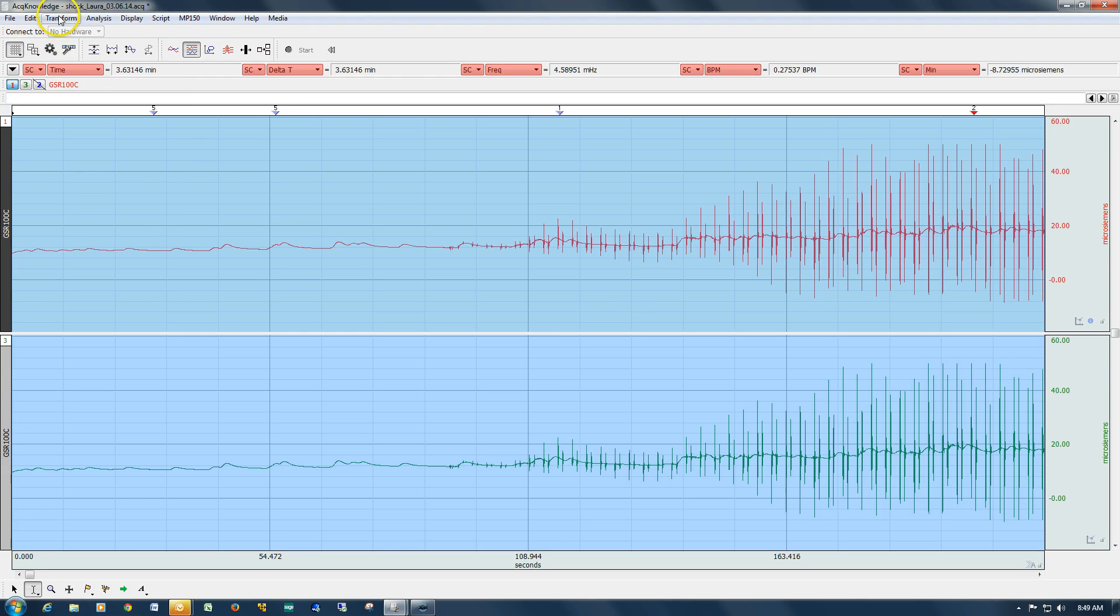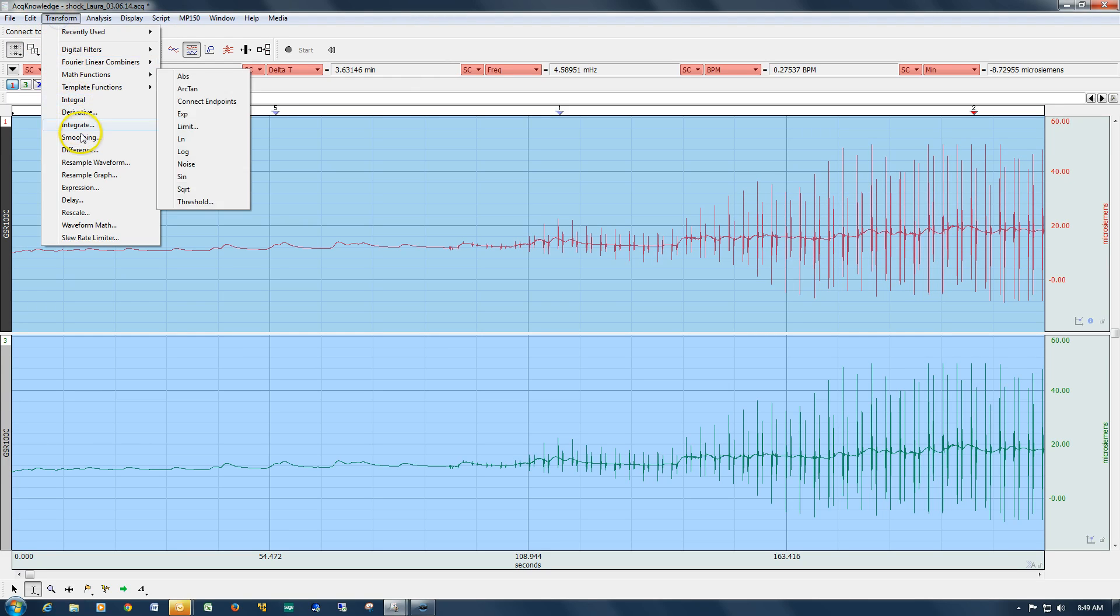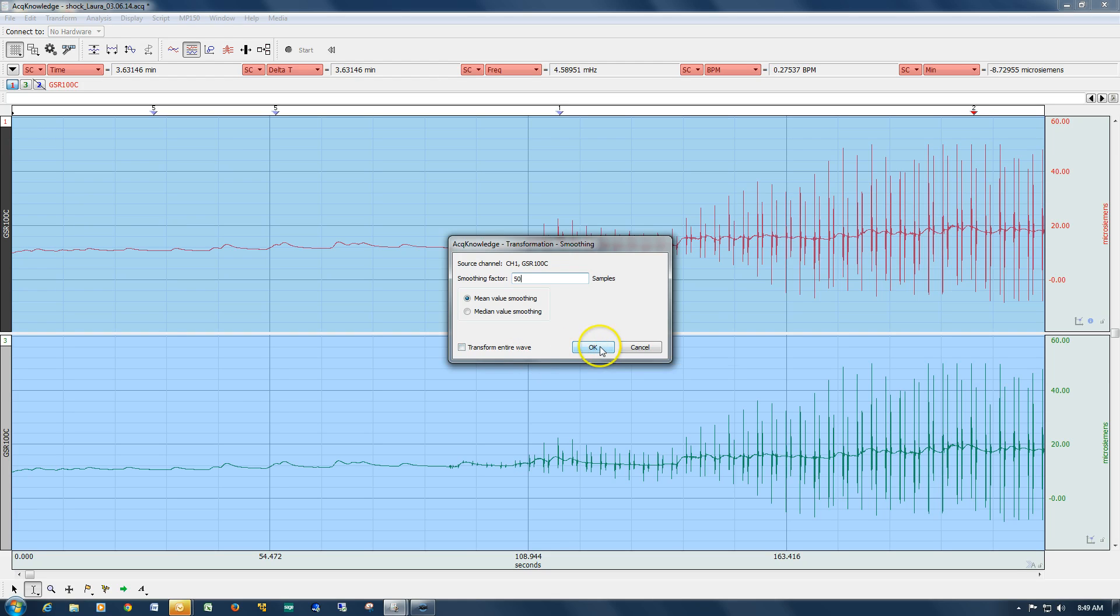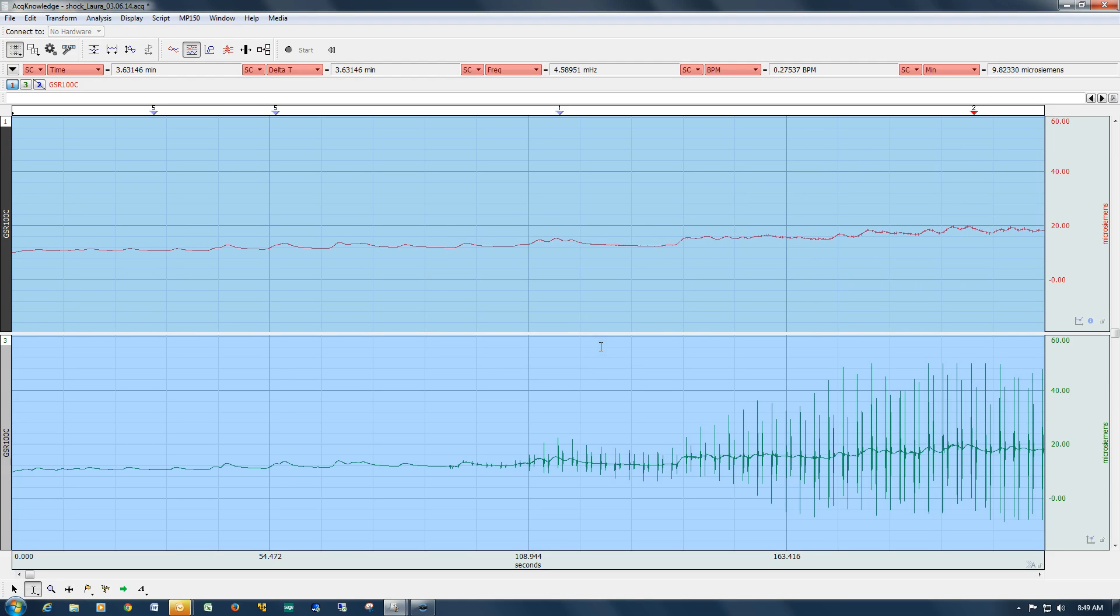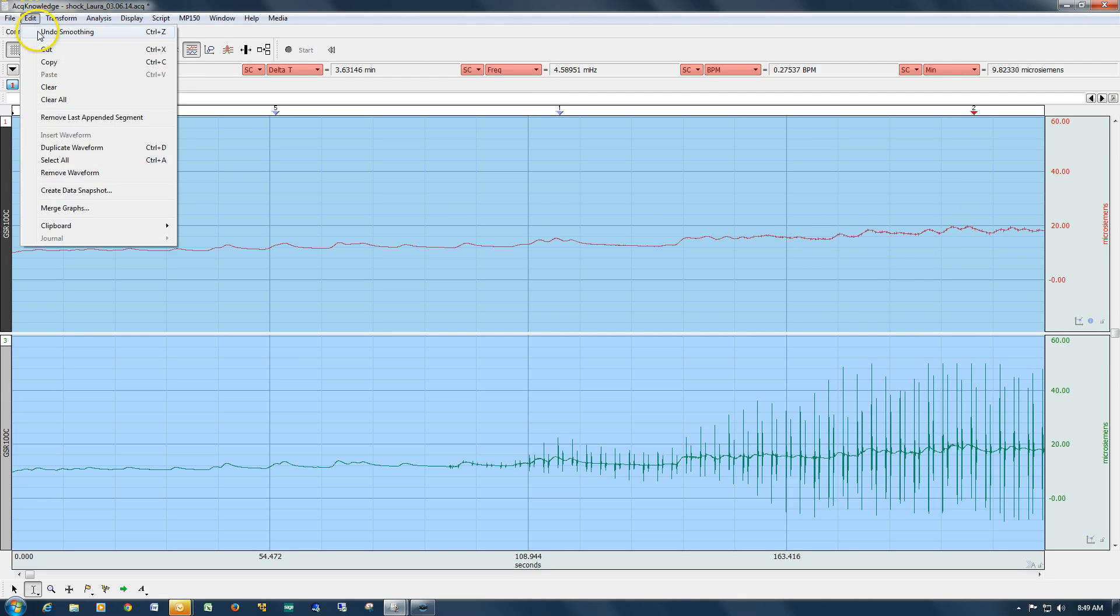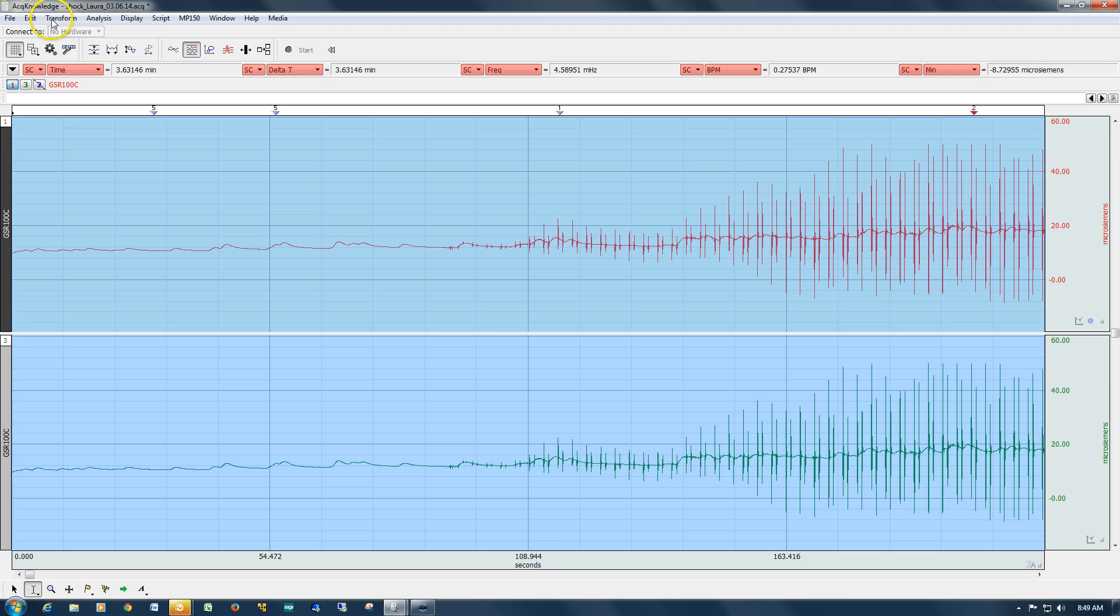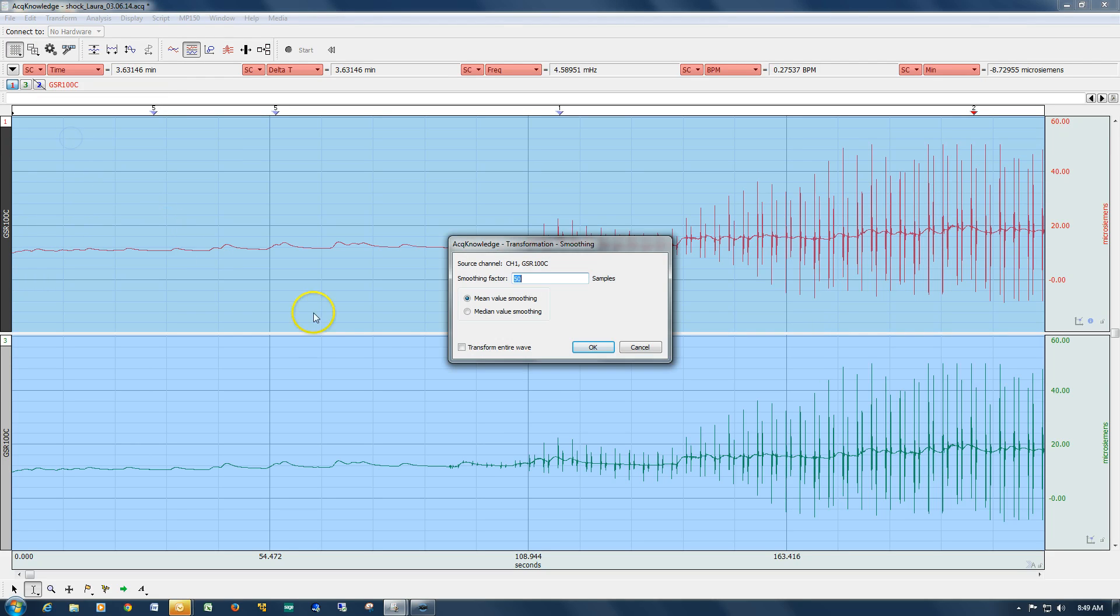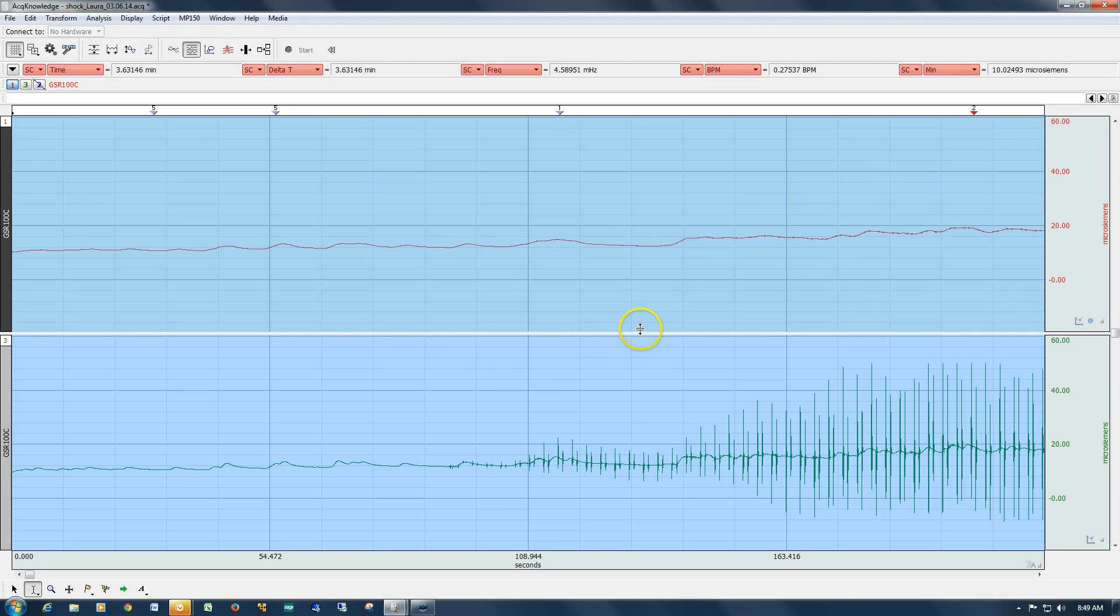I'm going to do it one more time. I'll try it a little bit more aggressively. You can see we've still got the spikes in there. I'll try it a little bit more. Still got some of the spikes in there.